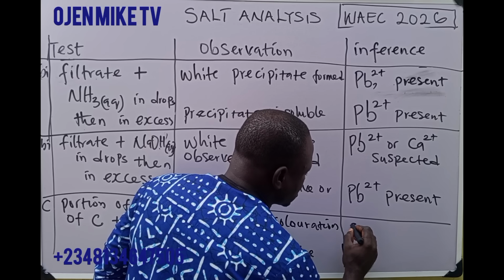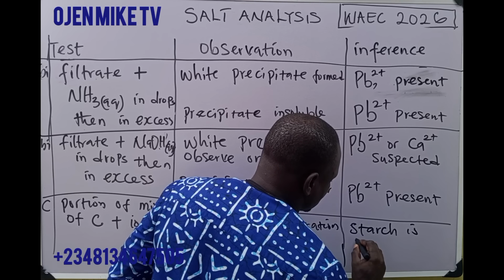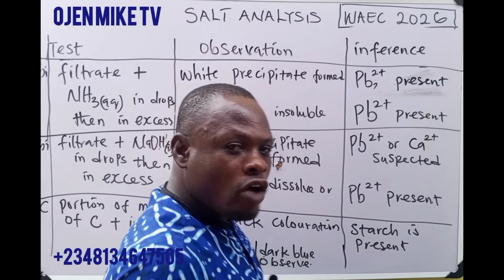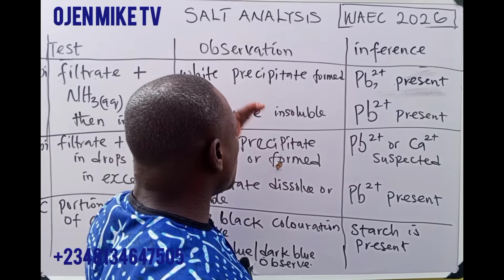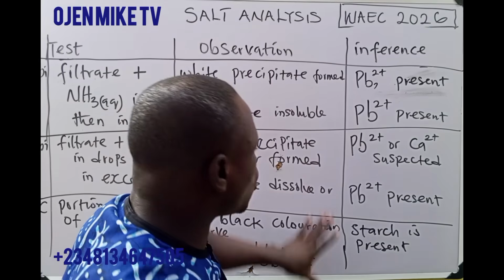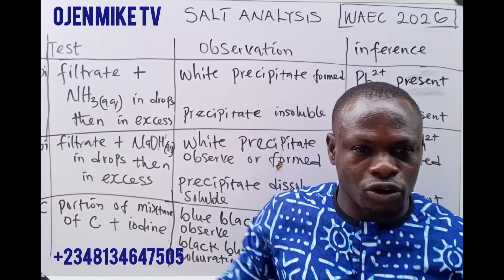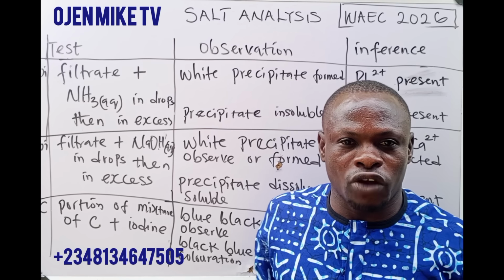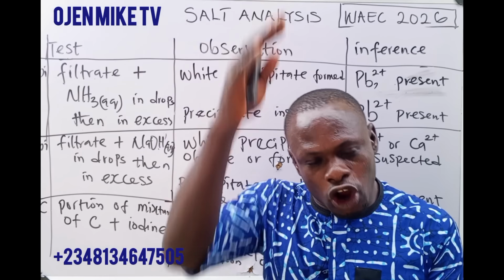So here, starch is present. Some can say presence of starch. You can just rephrase it, okay? Starch is present. So this is all what you should be expecting, more especially this one, it is accurate. 98% accurate. My predictions are always 98% accurate. Check my previous video on the past WAEC and NECO predictions. You see that they always come true.